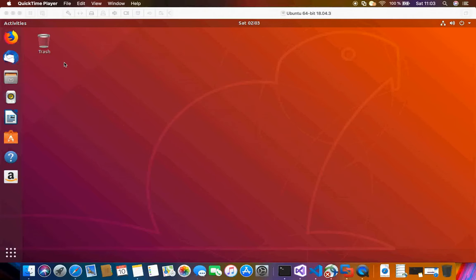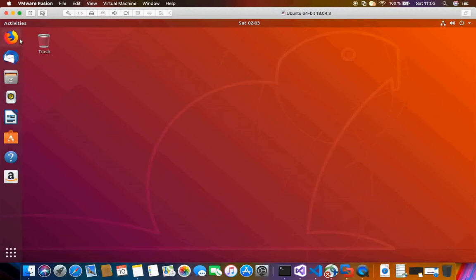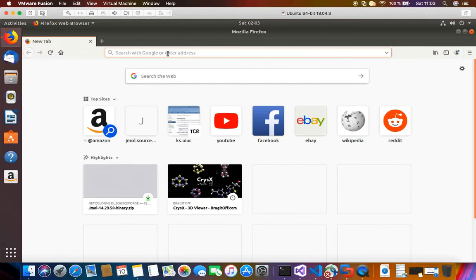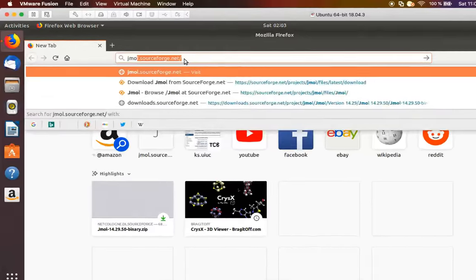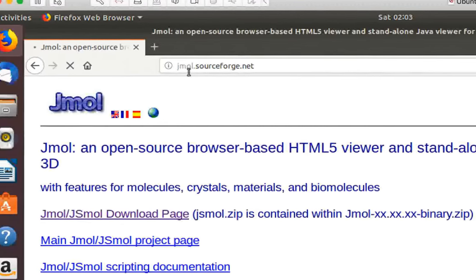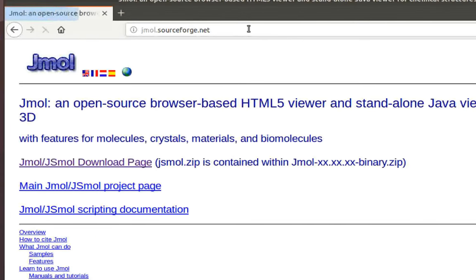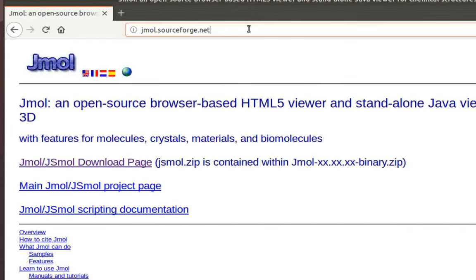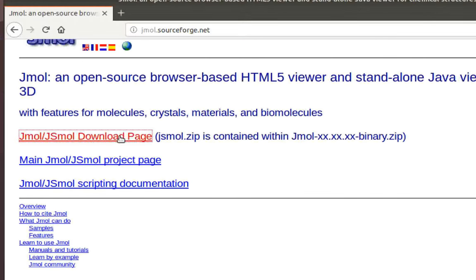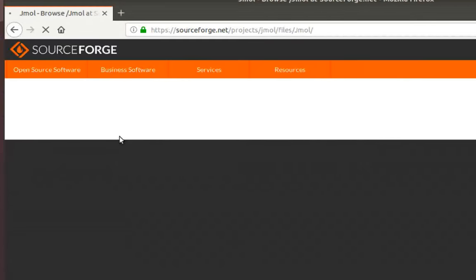In order to install it, just launch a web browser on your Linux or Ubuntu PC and search for Jmol. Head over to their home page at jmol.sourceforge.net, then go to the download page.